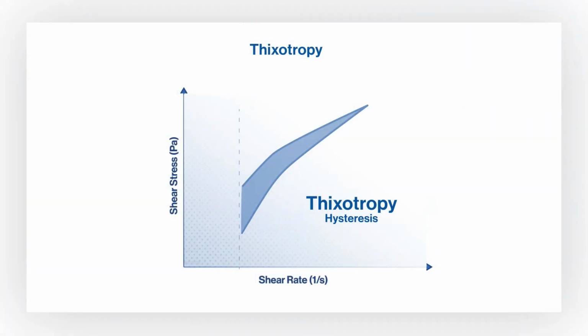The corresponding graph shows that when the test is complete, the initial shear stress was higher than the final shear stress at the same starting shear rate.